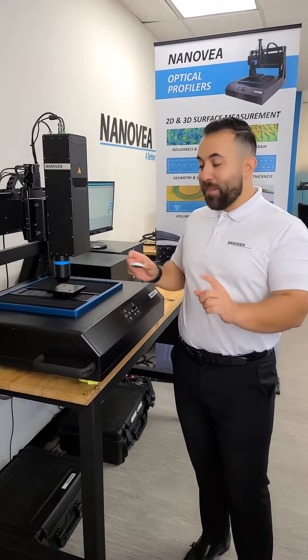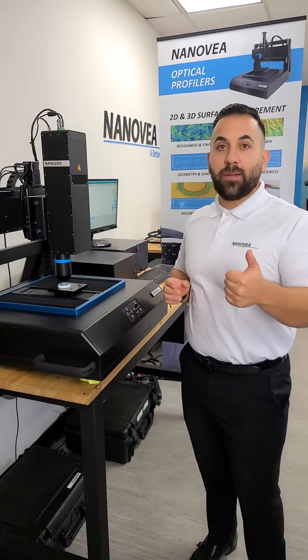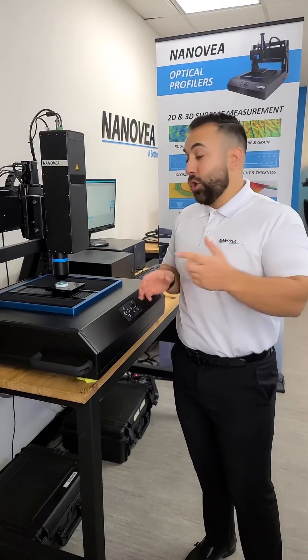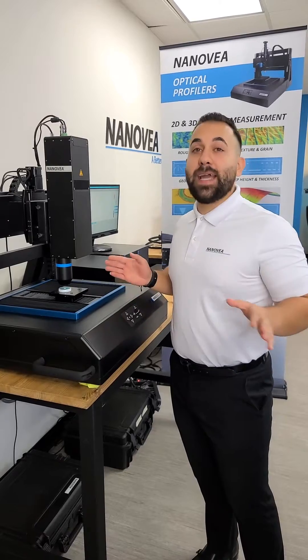With the white light chromatic technology, it is as easy as just placing your sample on the stage. There's no prep time. There's no need for refocusing. You could do large area scans with no stitching. And the best part about it all is we don't need any algorithms.